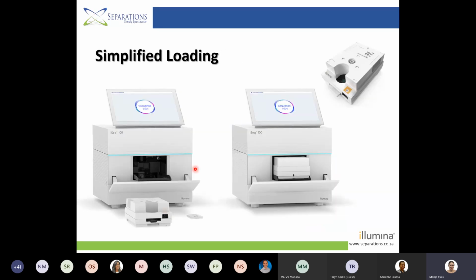And I just wanted to illustrate to you that you have a cartridge, and the flow cell will go into the cartridge, and the whole cartridge and the flow cell together will go into the system, and you can just start sequencing, and it will go through. It's really dark to see inside, but if one day you are able to see it up close and personal, you will see that there is not much to the instrument itself. This is why it's a much more affordable NGS option out there.